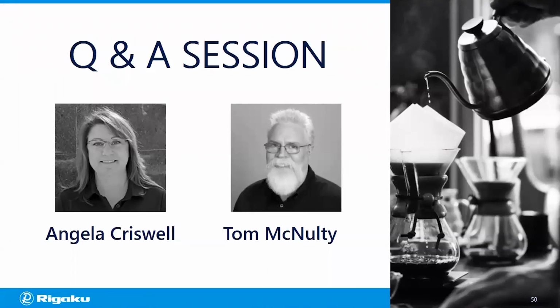Another similar question again from David says, I'm using contrast agents on seeds, and I find that iodinated compounds work at about a 30 milligram per gram tissue concentration level. I would appreciate any advice. I honestly don't have much for you. I have very limited experience with them. I tried a few things that I thought I would introduce in this webinar and just didn't have time to complete them. But I would be really interested in chatting with you about that further. Perhaps we need a webinar on just talking about contrasting agents. A good future topic. Yes, definitely.